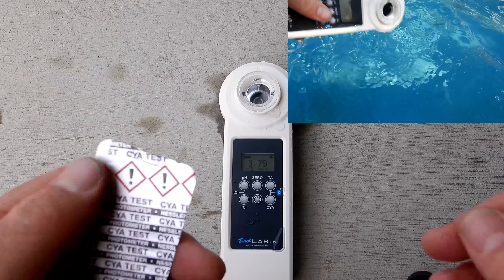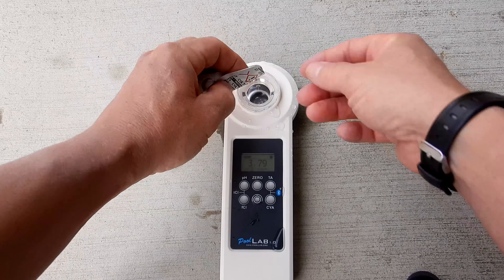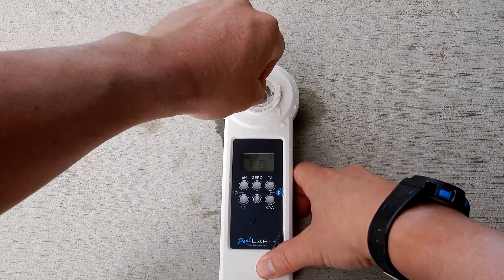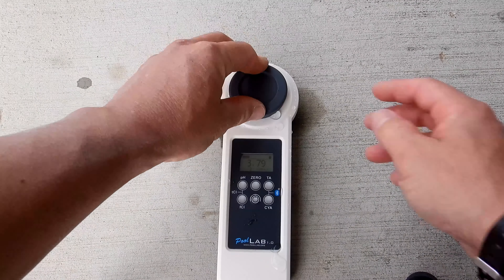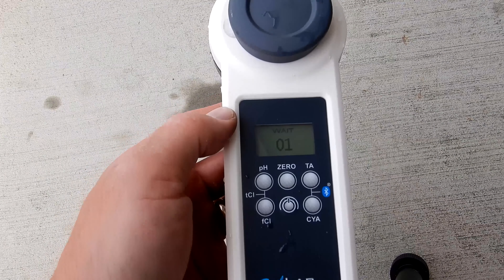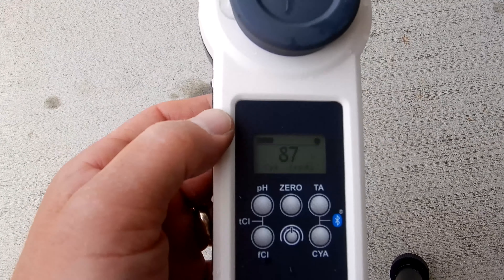The last test that comes in the kit is the cyanuric acid test — it'll test up to 160 parts per million. We're going to drop it in and break it up. These are the test factors that come when you order the unit. Cover it up and push the CYA button. The CYA here is coming in at 87, so it's a little bit on the high side, but it's acceptable.